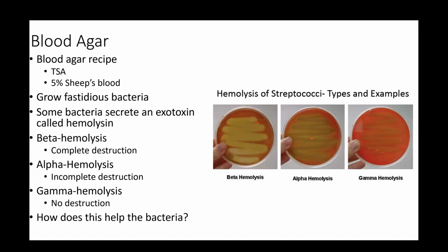into a really good buffet. And if you recall when we were talking about fastidious versus non-fastidious, a lot of bacteria, and in fact a lot of bacteria that are pathogenic and that really like growing in us humans, are actually pretty fastidious. They need a lot of these supplemental factors in order to survive, and that's why they like being in us so much, because we provide those factors to the bacteria. So adding this sheep's blood to the agar is going to allow us to grow bacteria that are pretty needy, and need a lot of these unknown growth factors that blood, in this case sheep's blood or our blood, can provide.